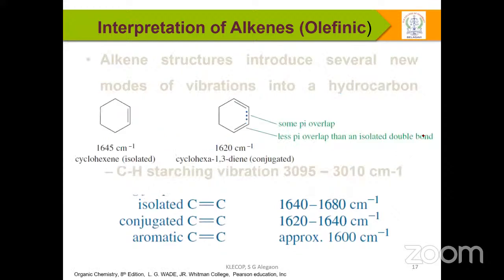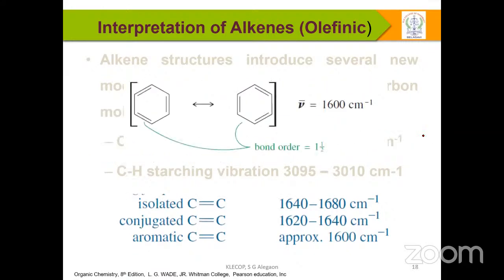Okay, so if you see this in conjugated and non-conjugated systems, and apart from that in a benzene system, what helps us understand better is the bond length. The carbon-carbon single bond length is 1.53 angstrom, whereas the carbon-carbon double bond is 1.34 angstrom, whereas benzene has 1.38 to 1.39.